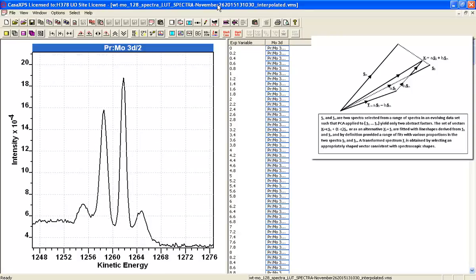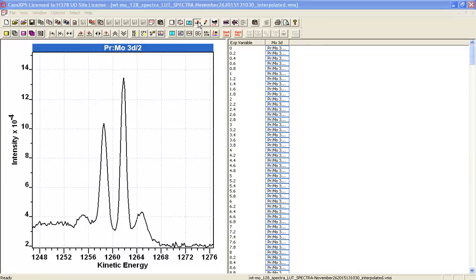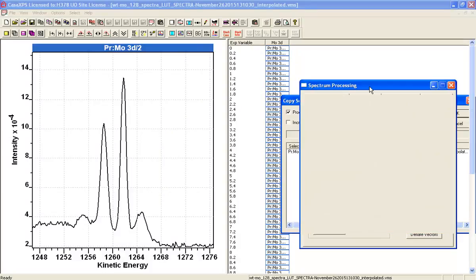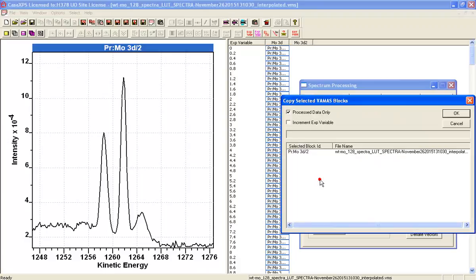and I'm now subtracting these data and displaying the difference spectrum to the point that I can now see that I'm getting something that looks like it's got predominantly molybdenum disulfide and perhaps some oxide here. But that'll do for a first approximation, so let's take that one and I will copy that, and that gives me my first spectrum that might be of interest. And now I think I like this one also, so I'm going to copy that one.